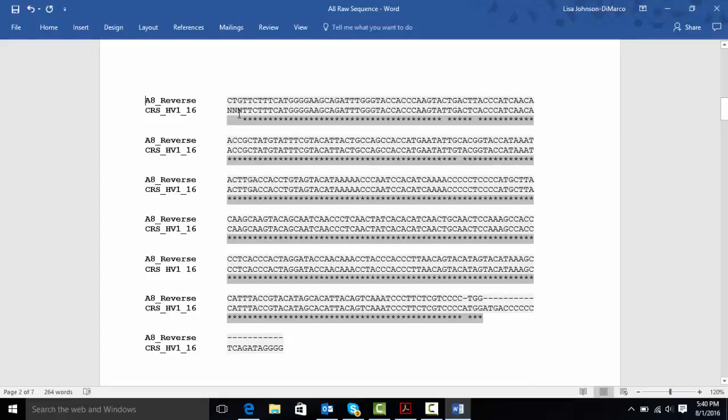You'll notice that the 3 N's line up with CTG, and when we number this alignment, you'll see why that is the case. And then where we're missing stars here, you'll notice that the bases are different. And then here at the end you have some spaces, and that just means that our sequence was shorter than the reference sequence, and we'll be deleting those once we number the alignment.